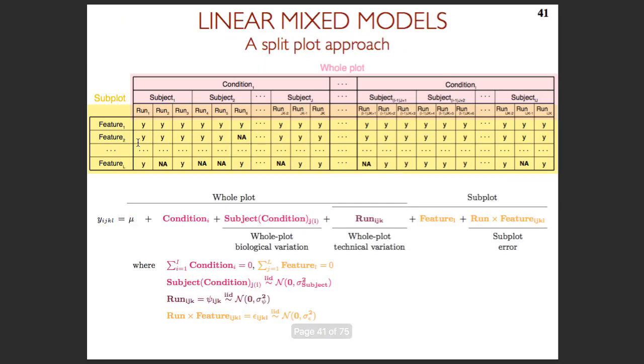Okay, so if you remember from last week, we talked about the fact that the two group comparisons, we can extend them with more complicated models, which essentially describe every source of variation which can affect the intensity of a peak. So this is what is happening here as well. This is more advanced than we have time to speak about here, but let me just give you the very high-level overview. So y is just like last week. It is the log intensity of a feature, right? It's a number in this table.